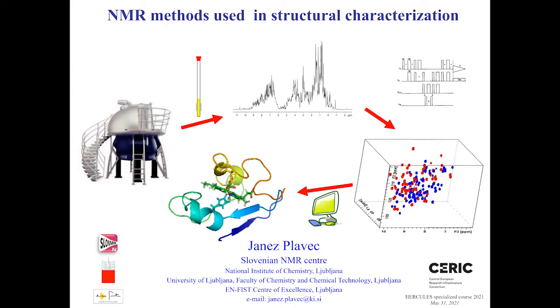We need some model, usually done with a computer nowadays, that gives us insight into structure. Here we have a simple protein. It should jiggle and jump around, exactly to indicate what I'll be coming through. NMR is a unique tool, providing complementary information to other techniques that give high resolution insight into structure details, but furthermore gives dynamic information. And dynamic, I'll explain as we go along.